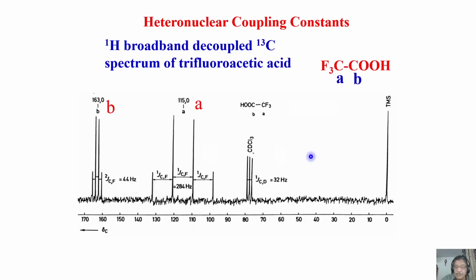Okay. So there is a lot more we can talk about. Today I will stop for the day. We have discussed a lot about carbon-13 NMR, which is one of the most extensively used nuclei. We'll come back tomorrow and continue a little more about carbon-13 NMR: how to assign the different carbons attached to different protons, by using techniques called DEPT, INEPT, APT, etc. More discussion about that I will do later. And then I'll stop.